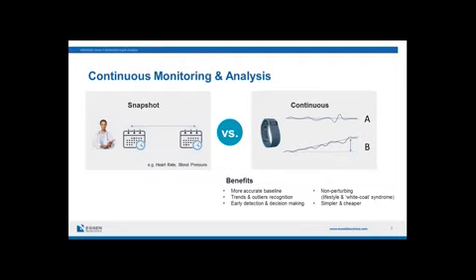more detailed analysis done. Hopefully it's clear from this example the benefits of this continuous monitoring are firstly more accurate baseline, secondly the ability to determine or detect trends and outliers in the data set, and you can use that early detection to make an early decision. You wouldn't wait for 6 months to go see your GP if your trend was for a rising parameter.